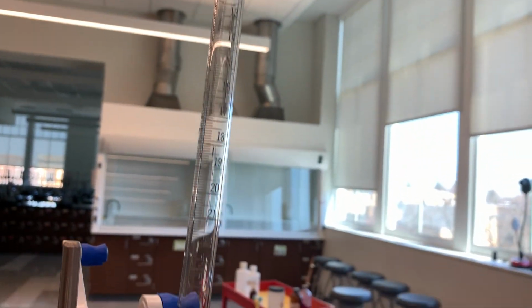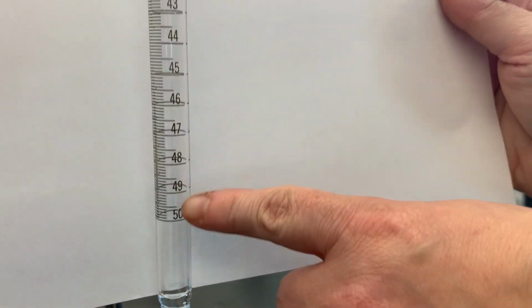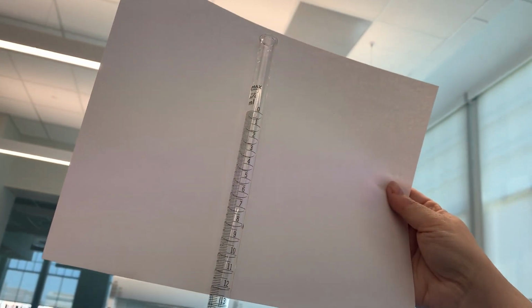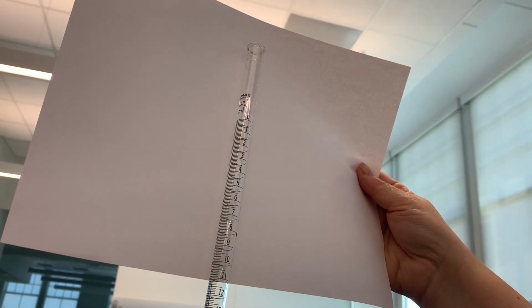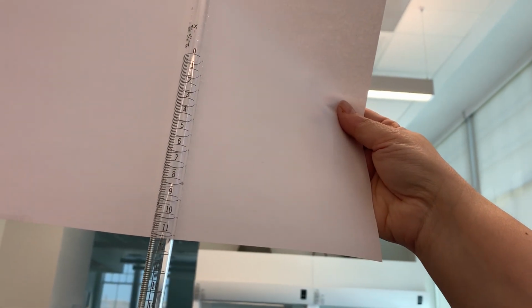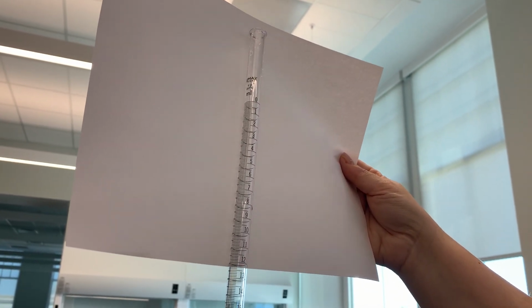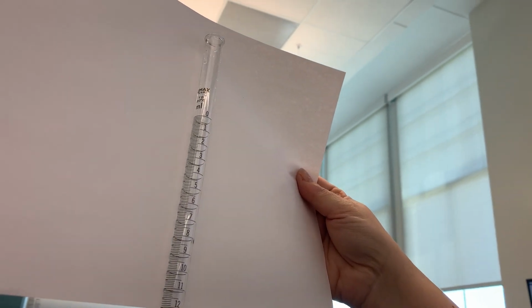You can see that burette is graduated from 0 on top down to 50 on the bottom. So this is a 50 milliliter burette. The burette has graduations of milliliters. You can see the numbers. So 50 is down here, and 0 is up here, and then goes 1, 2, 3, and so on. So these are milliliters, and as you can hopefully see, there are 10 graduations in between each milliliter mark. So the distance between two nearest graduation marks would be 0.1 milliliter. We typically read the burette to the nearest 0.05 milliliters, which is half of this tiny distance between graduation marks.